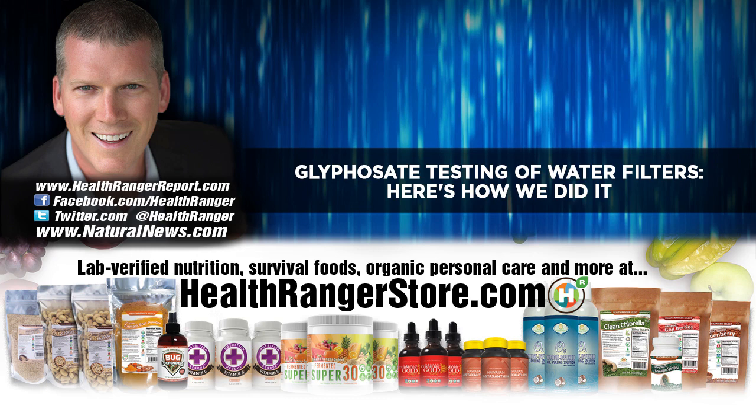If they're even slightly contaminated with metal, the metal ions latch on to the media inside the Torus DEA column, and they create horrendous tailing effects. And the tailing effect is when your peak starts out good on the front side of the peak, but then the back side of the peak falls apart, fades out, gets smeared over several minutes. You can have like a 4-minute peak or a 5-minute peak, which for the most part, chromatography software won't even consider to be a peak. You can't even really work with it. It doesn't integrate correctly. So we played with that for months. I don't know how many months, quite a long time. And that was really the best recommended method that we could find.